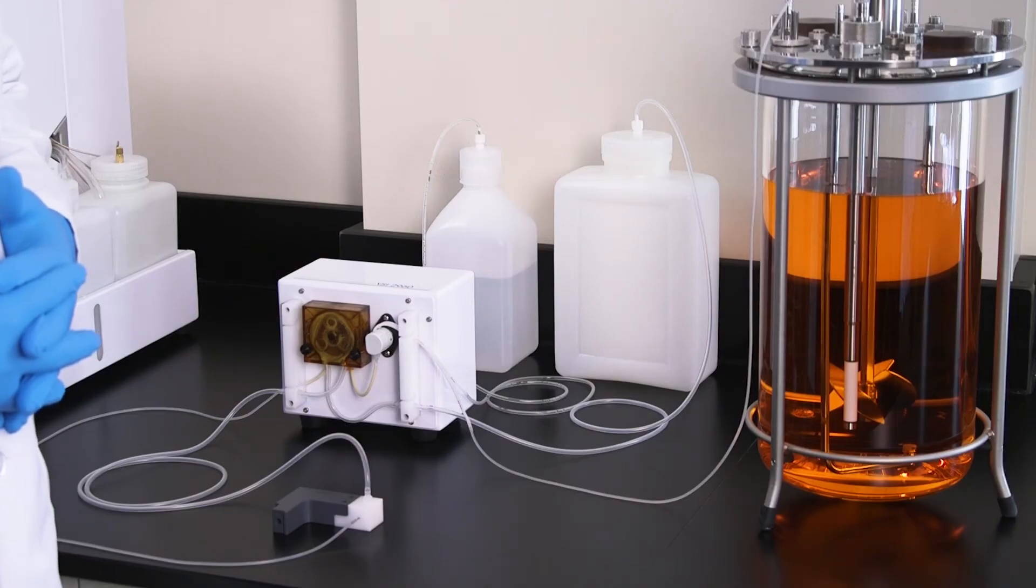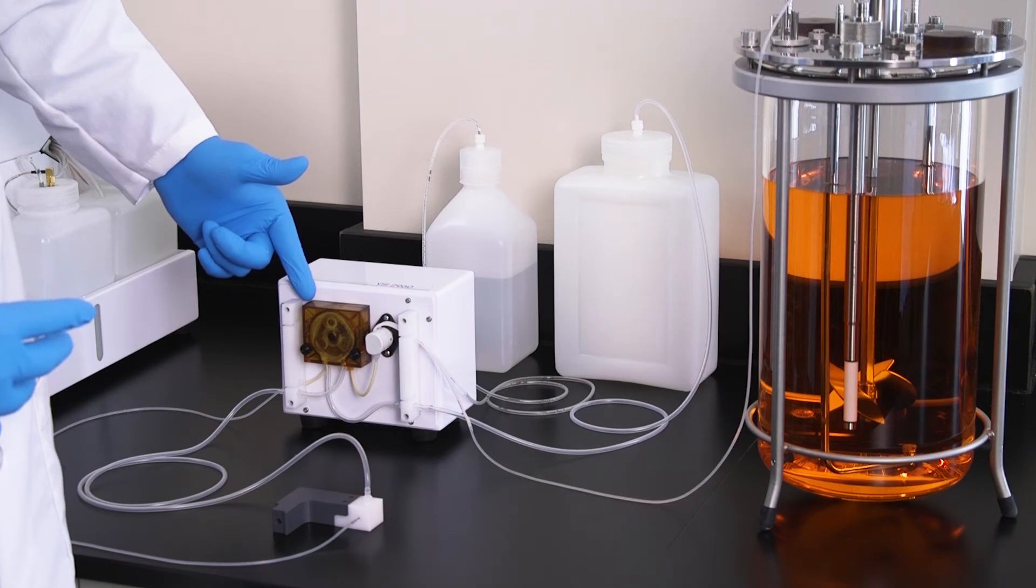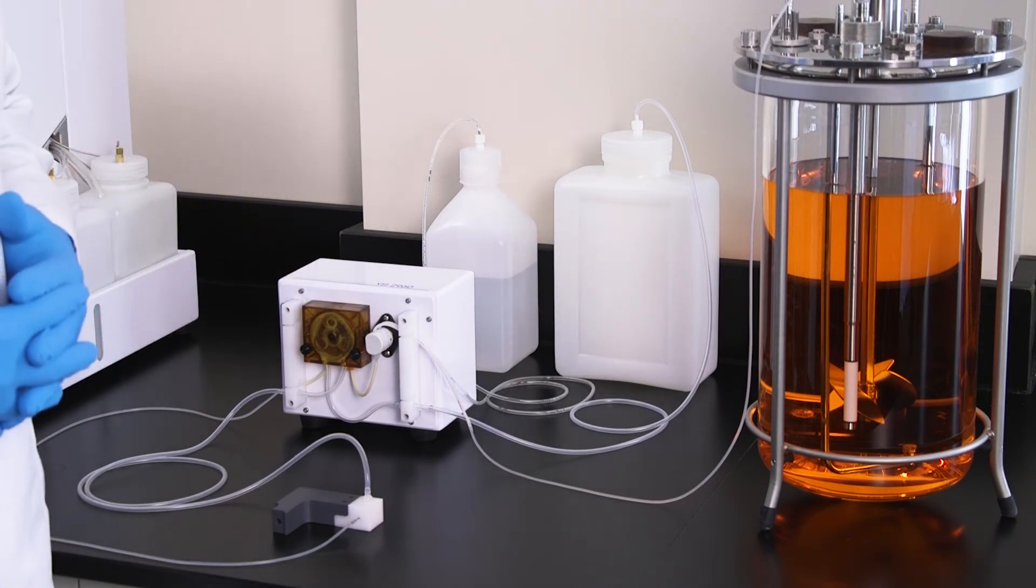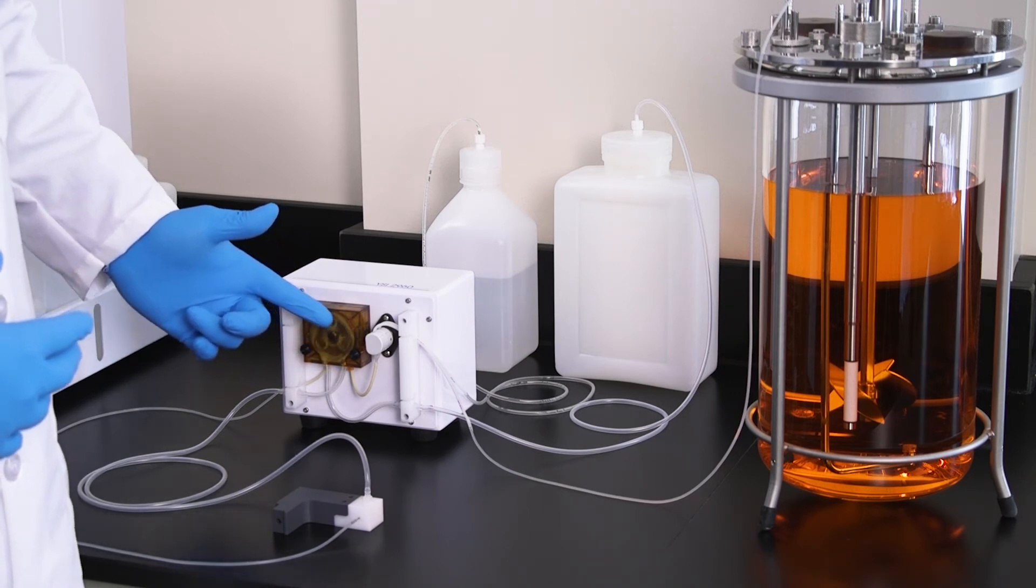Once the pinch valve tubing is configured, we will proceed to the amber-colored peristaltic pump head. As this is a unidirectional pump, you will want to ensure that the tubing is fed into the right side of the pump head.